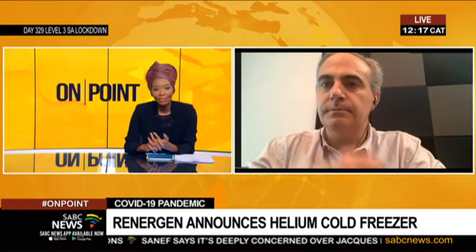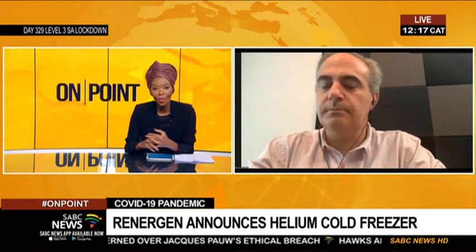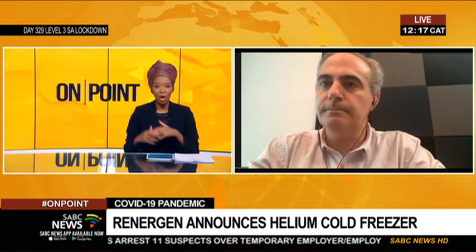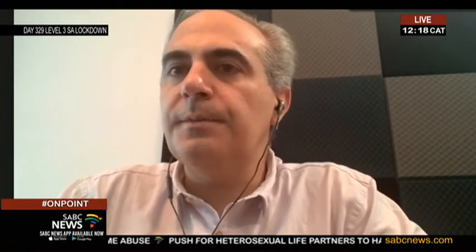When I was reading about this, that 30 days without power supply seemed to be quite a uniquely South African consideration. Did you think about the challenges that we have with power supply, with Eskom and load shedding when you were designing that? Not so much about load shedding. I think the bigger concern, because there are freezers that'll keep goods cold for a period of up to 12 hours. So the load shedding isn't that much of a concern.